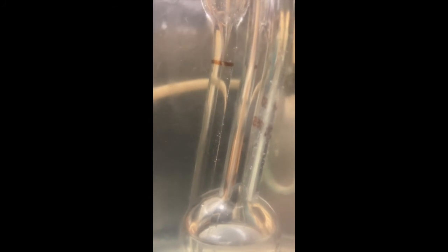Now it becomes critical to watch carefully, because when the meniscus enters the bore, it descends very quickly, and you want to capture the moment at which it passes the lower fiducial mark. Here it goes. Here it goes. Boom, that is when we stop the clock. Okay.